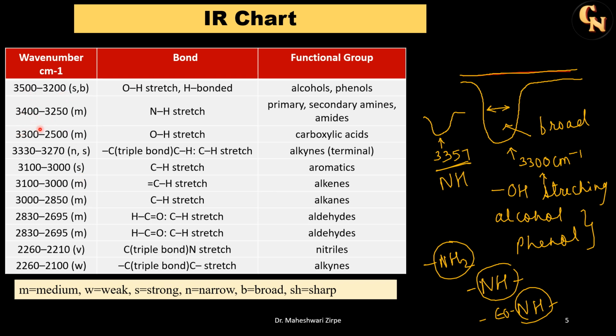Then you have to guess by seeing the signal, whether it is broad, strong, or medium. Okay, from those signals you can guess whether it is amines or OH.